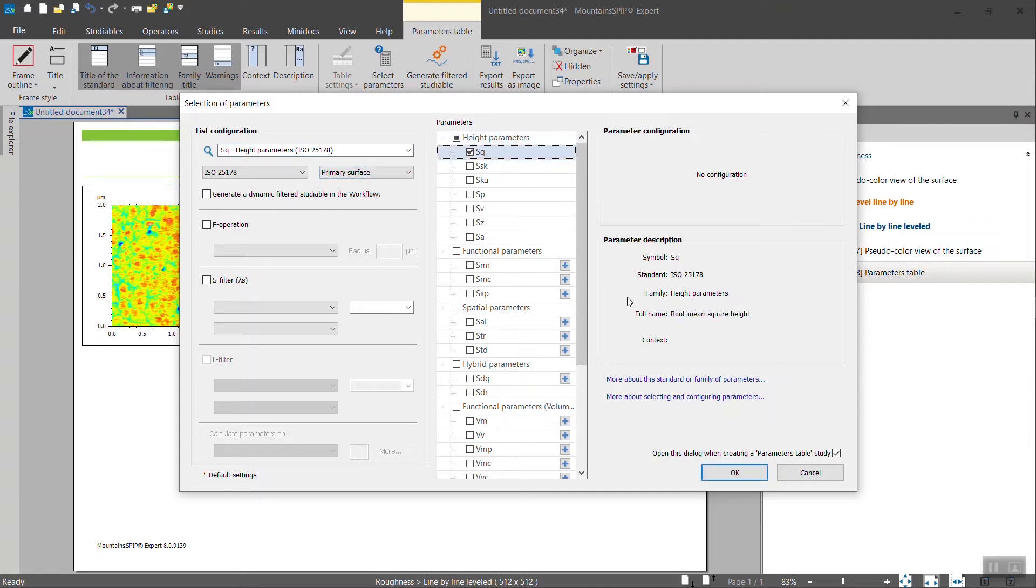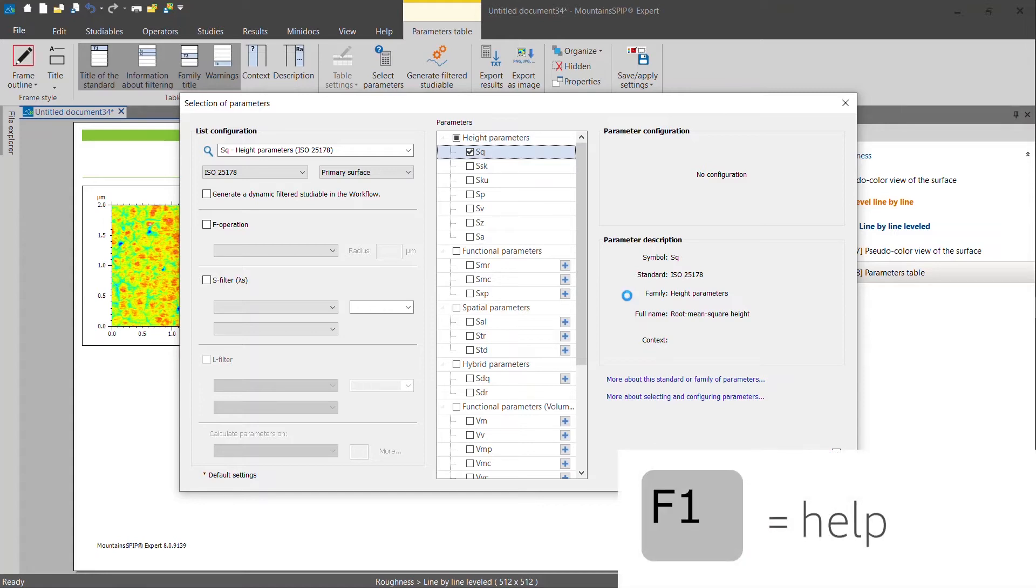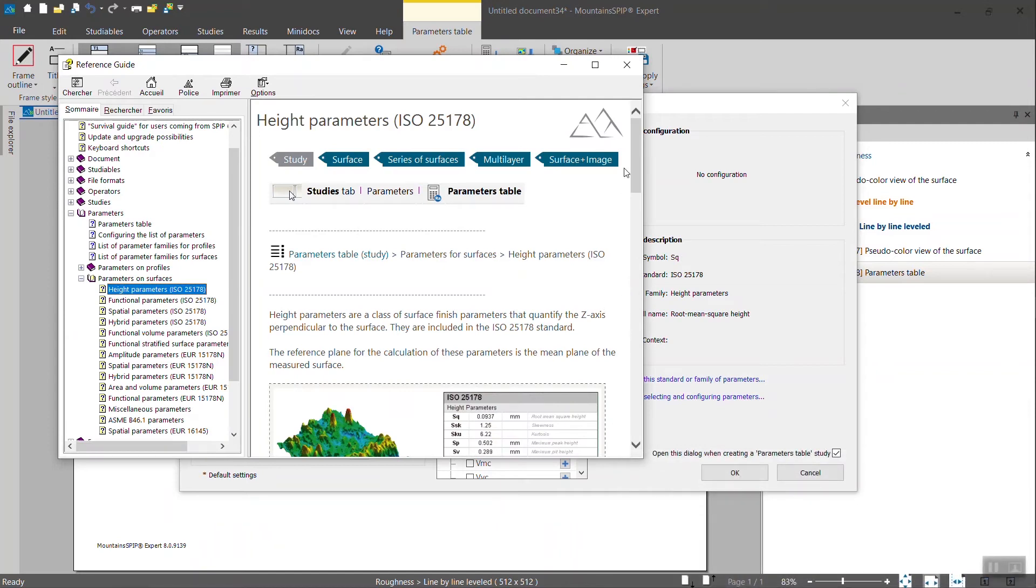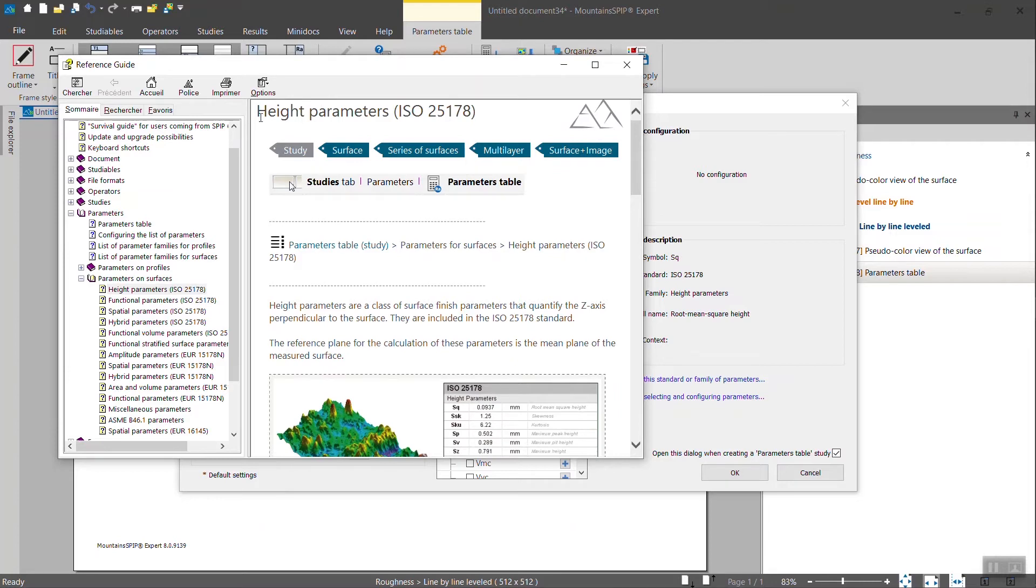If you're unfamiliar with the parameters, the definition, how they can be used and why, you can press F1 in any part of the software, actually, to get a contextual help. So here you have information related to all of the parameters, the height parameters of that standard.